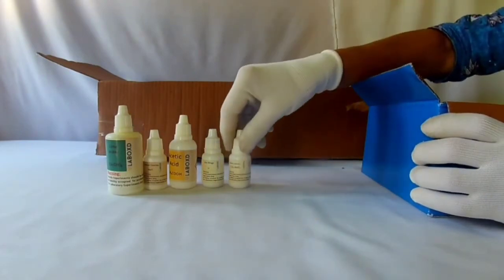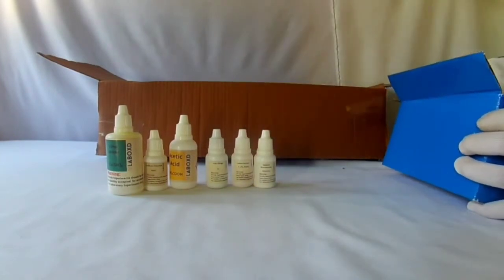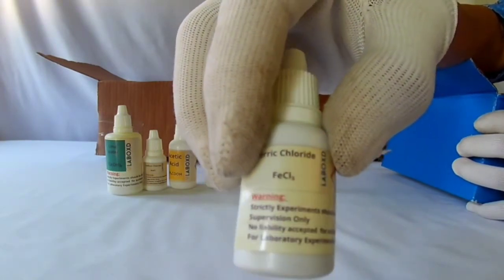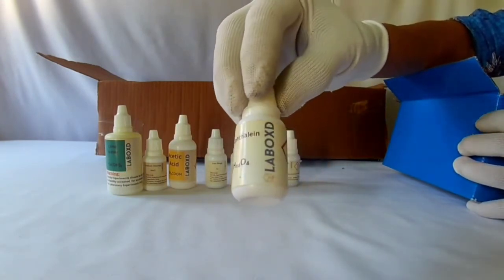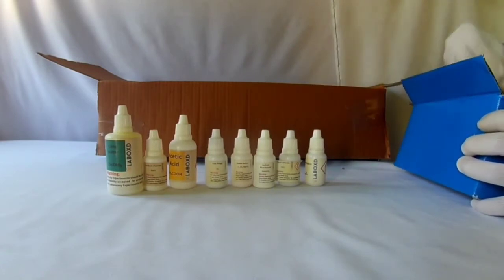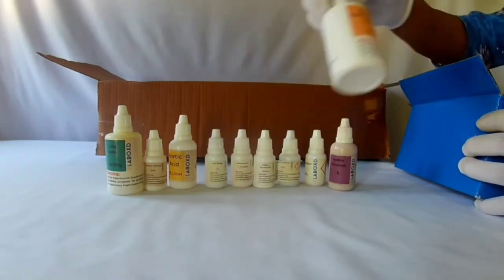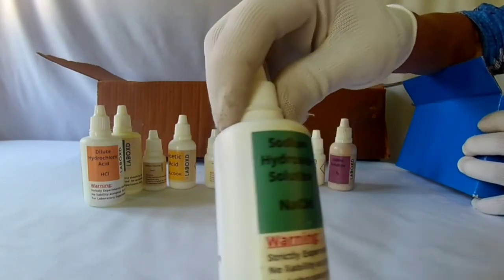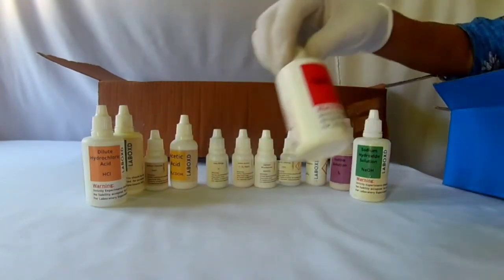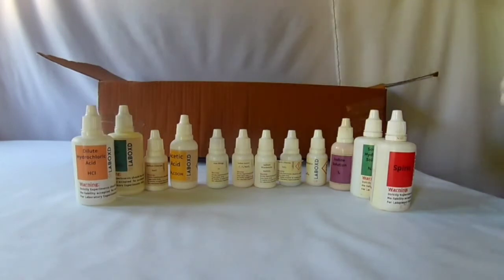Sodium acetate, sodium bicarbonate, ferric chloride, phenolphthalein, iodine solution, dilute hydrochloric acid, sodium hydroxide solution, spirit. Wow, it looks like a chemistry laboratory. I feel very happy.